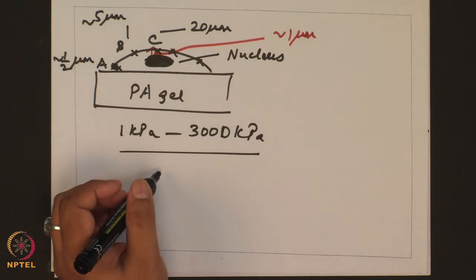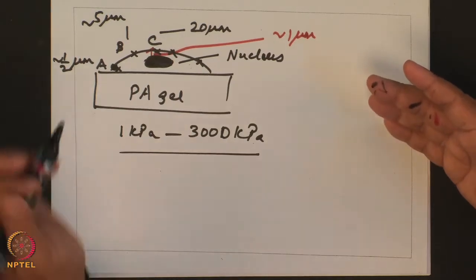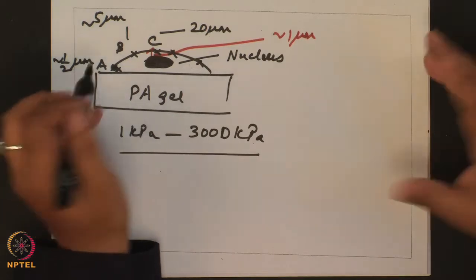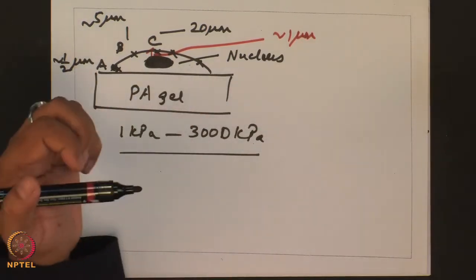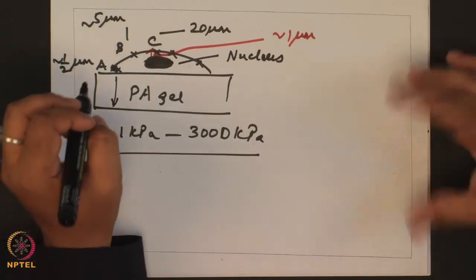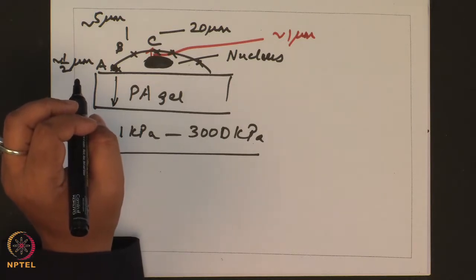Does it make sense? This is where you have to be wary about the assumptions of the model, which assumed that your sample is a semi infinite half space, which means that it does not have finite width in this direction, but it is infinitely wide, and along the thickness axis also it is infinitely thick. So, these are the artifacts.